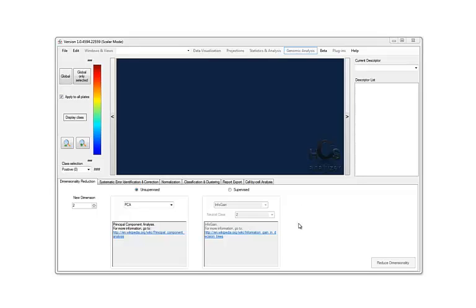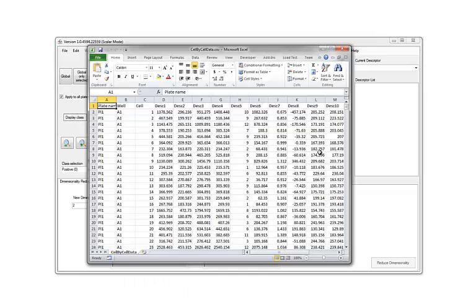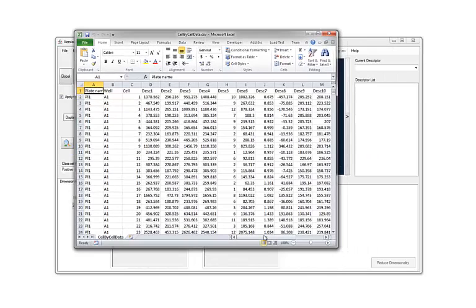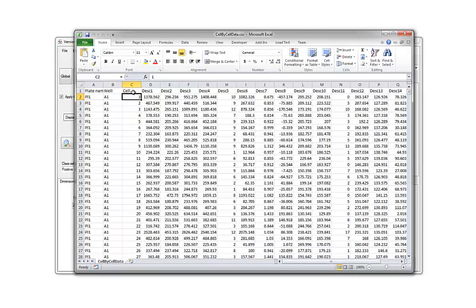The first thing that you have to take a look at is how to generate data that will be compatible with HCS Analyzer. This is the typical kind of data that has been generated after a screening cell by cell. What does it mean? It means that, as you can see, the first column contains the name of the plate, the second column contains the name and the position of the well, and after, you don't have only one single signature for each well, but in a cell-by-cell data analysis, you have access to many different signatures, actually one per biological object in this case.